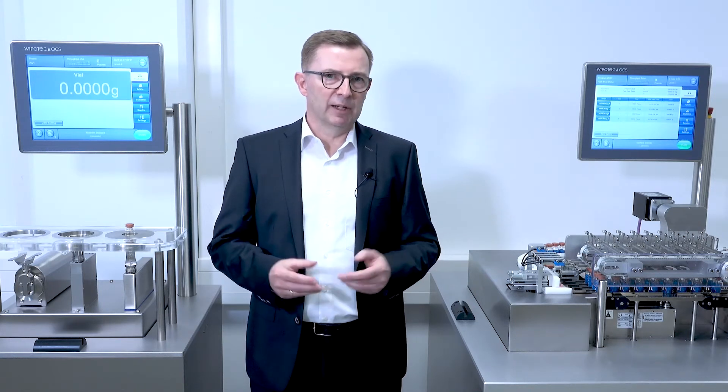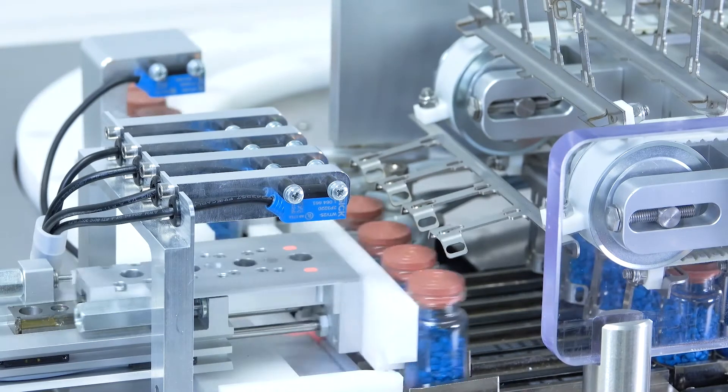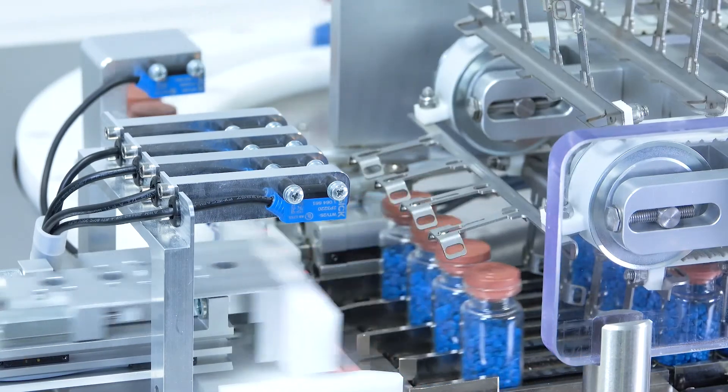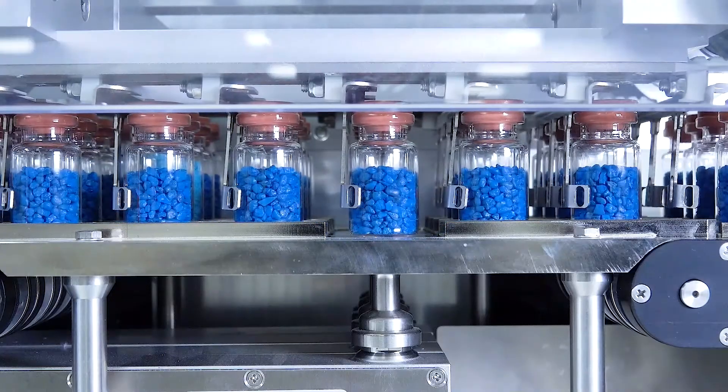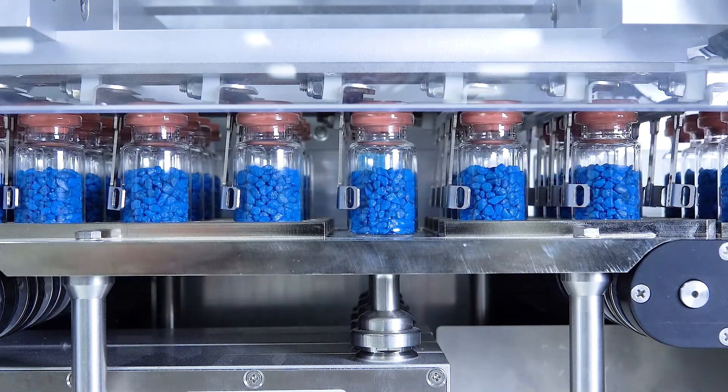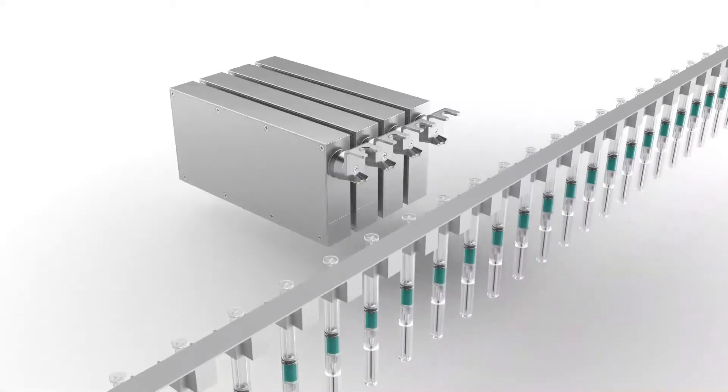However, more typical these days for the handling of bottles or vials is a robot system — a handling system like a walking beam, or what we see here, a pushover system. No matter which system is used, the number of weigh cells can be added next to each other with a very small track distance to achieve the needed throughput.